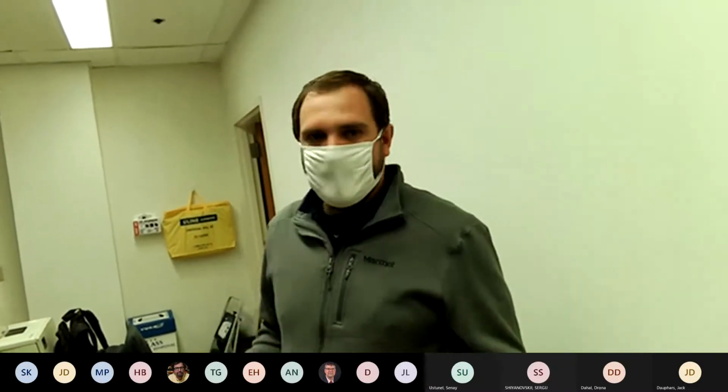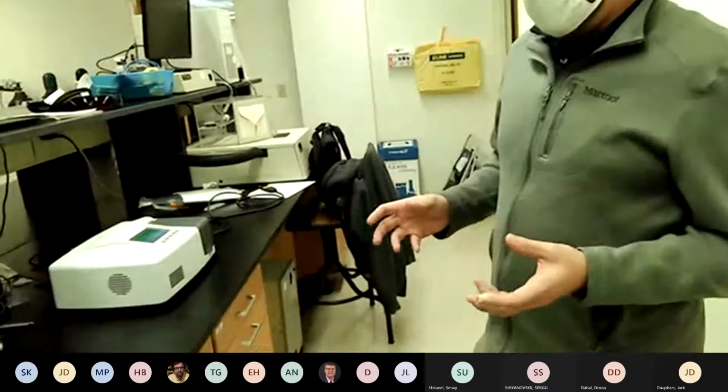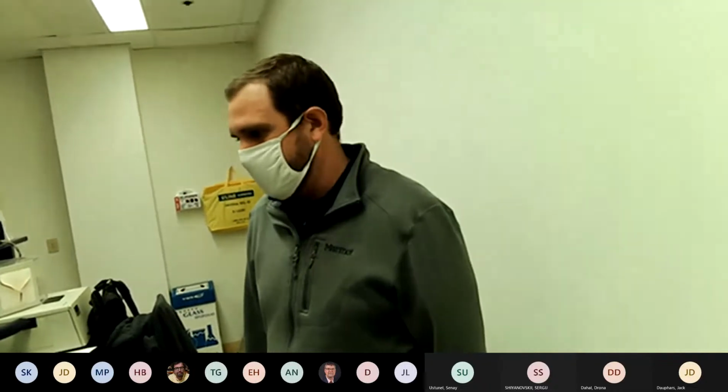But just for the purposes of what we're doing here, we'll try to get close-ups of the screen so you can get an idea of what's happening. We'll run a sample and show you the basics of how it works and what we can do with it. Once you get in the lab and play with it, you'll see a lot more of the capabilities, but we'll just do a general overview. If you have any specific questions, we can try to address those as well.